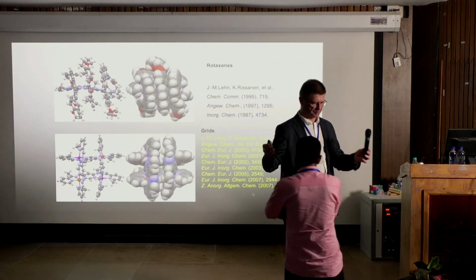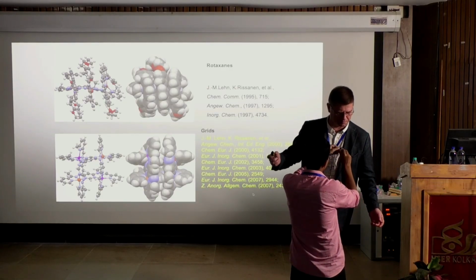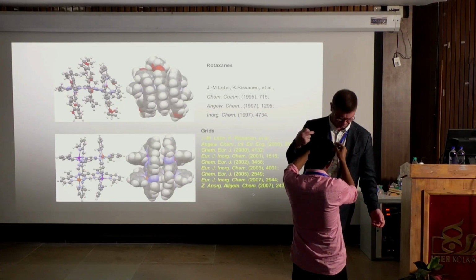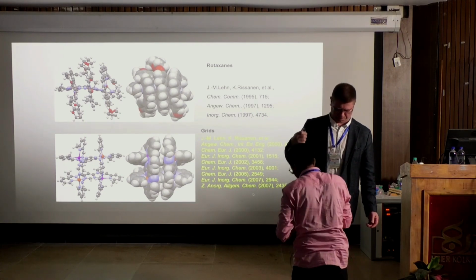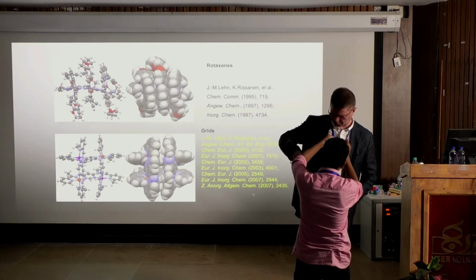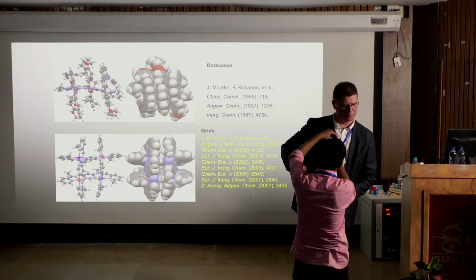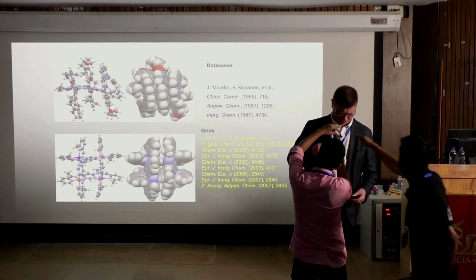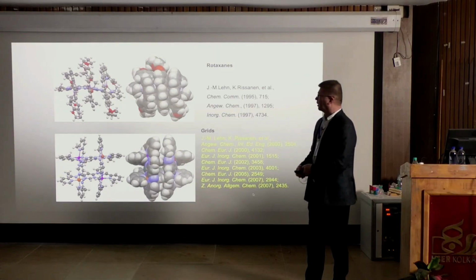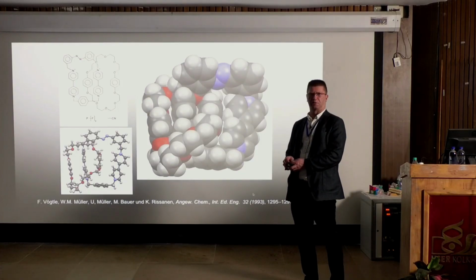Okay. Yeah, it works. Yeah, okay, that's fine. That, I'll go back. These catenanes.